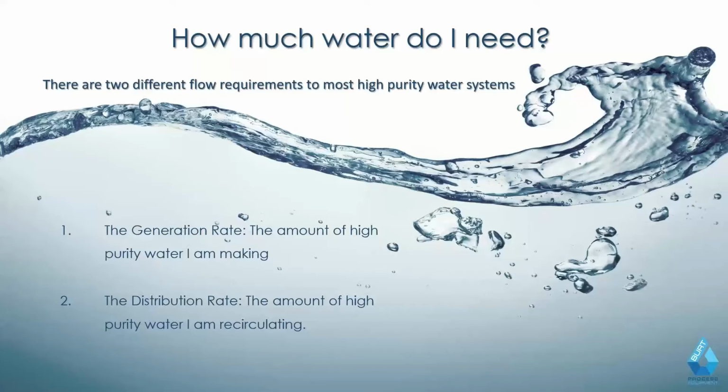If you have a humidification system, it may be drawing X GPM, and you need to account for that as part of your generation rate for your system. And then general lab use things like that ultimately will feed down to your balance of assuming how much volume per day, and that gives you your generation rate. Generation rates can be expressed in either 8-hour increments or 24-hour increments.